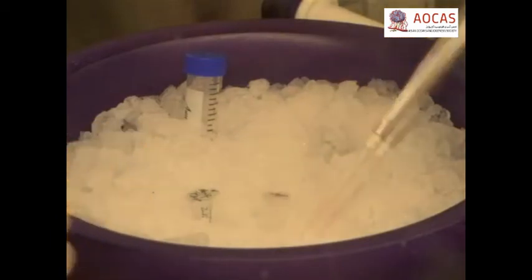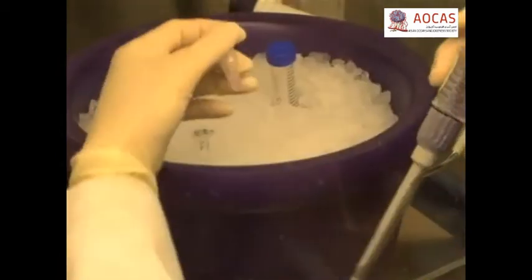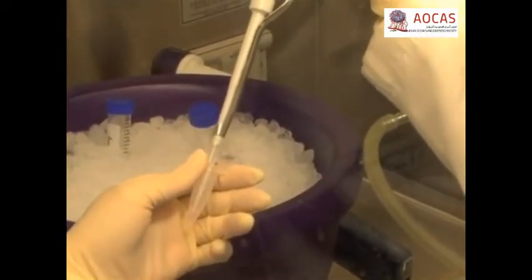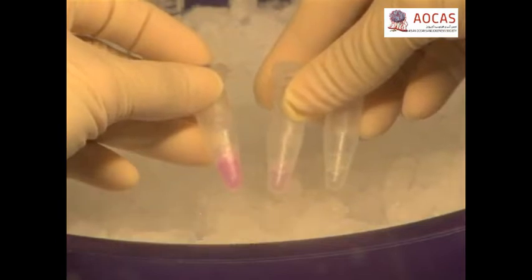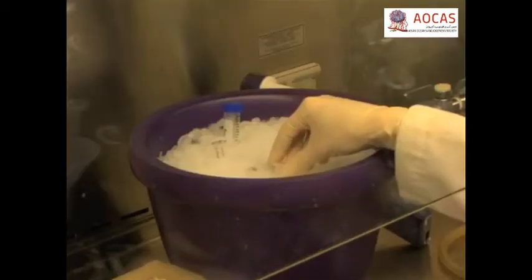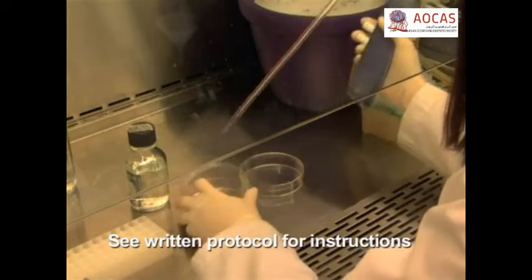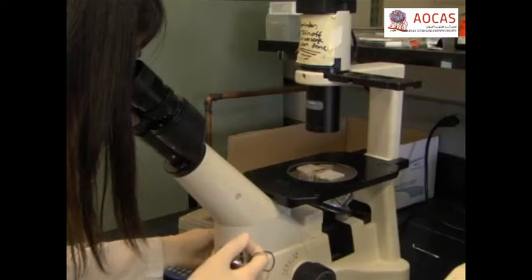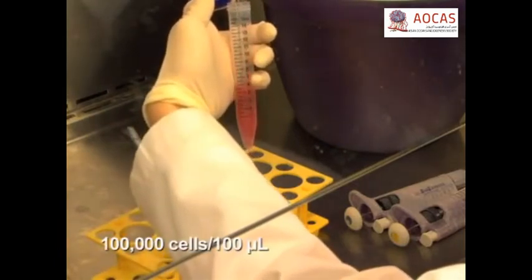For one graft, begin by mixing 100 microliters of collagen with 25 microliters of setting solution in an Eppendorf tube — refer to the written protocol for setting solution details. Pipette the sample up and down to mix thoroughly. Add collagen or setting solution in 5 to 10 microliter increments and mix thoroughly until the phenol red dye in the mixture changes to a light pink to orange color, reflecting a neutral pH. Keep the mixture on ice to prevent polymerization. Remove cultured fibroblasts and epithelial cells from plates by trypsinization and count each cell suspension using a hemocytometer. Pellet the cells then resuspend them in complete medium to a concentration of 100,000 cells per 100 microliters.